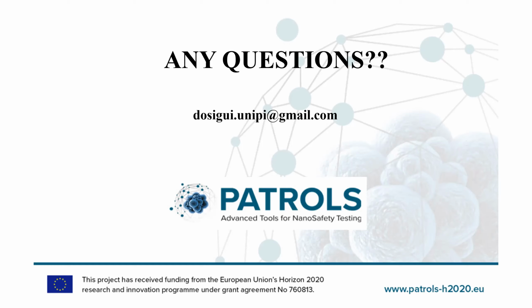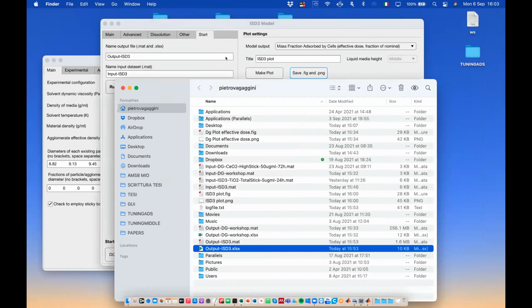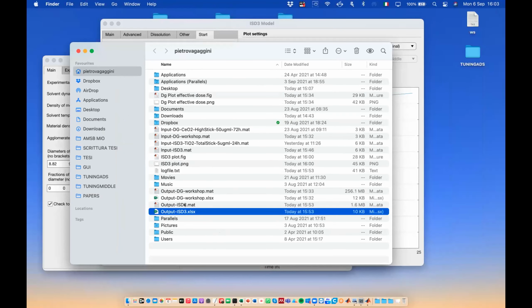So yes, I see there is already a question. Okay. Can you get out numerical data as well as the figures? Yes, maybe I wasn't very clear. Can I share my screen, Professor? Sure. Stop sharing.